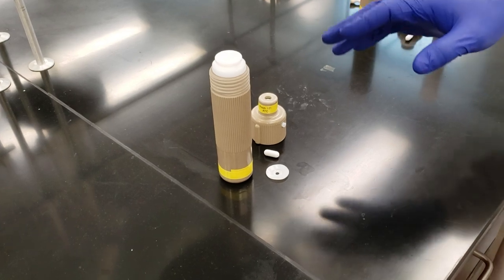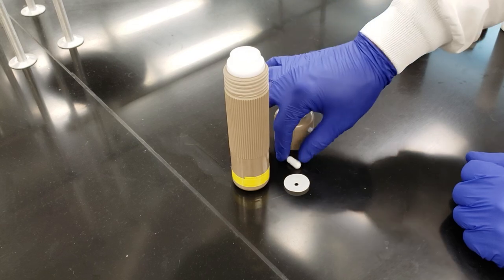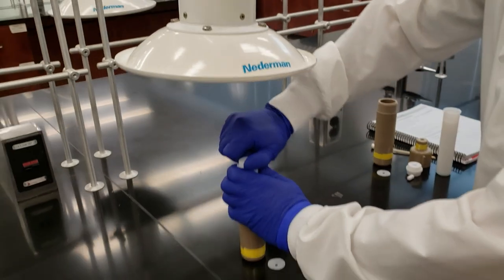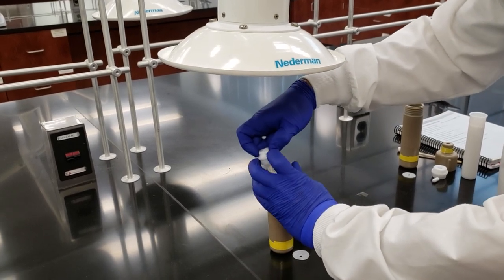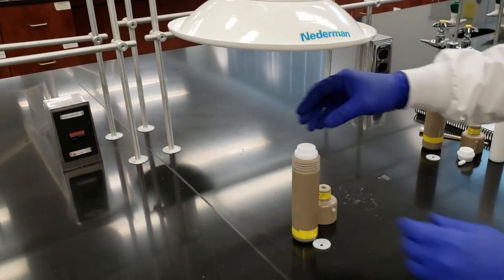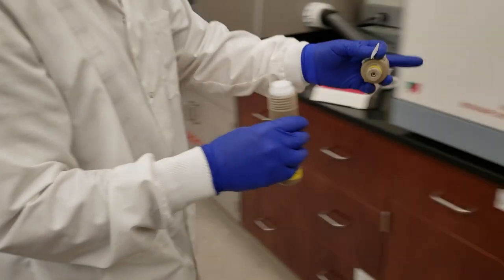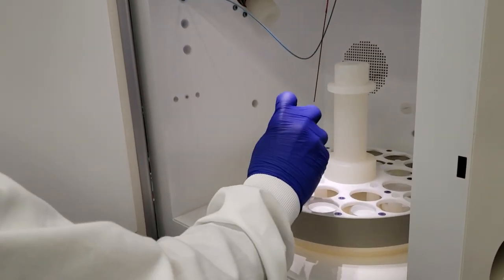This is the reaction vessel that we set up earlier. We have all of our reagents already inside of our inner Teflon sleeve. The last thing that we need to add is our stirring bar, so I'll go ahead and do that. I'm doing it under the snorkel, because there is quite an odor associated with this reaction. So I'll open it up, place in our stir bar, and reseal our inner sleeve here. I'm going to take my Teflon wafer and the top of our safety shield, and we'll come over here to our FlexiWave unit. I'll place it into position number one.